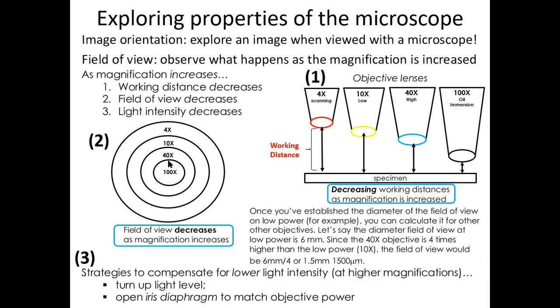So even though if you look to the ocular, it still fills the ocular, what you're actually seeing is zoomed in so much that you're basically seeing a smaller area, okay, just more magnified. So as you increase your magnification, you're decreasing your field of view, okay, and that's what that means. You're decreasing how much of the specimen that you can see at a time.